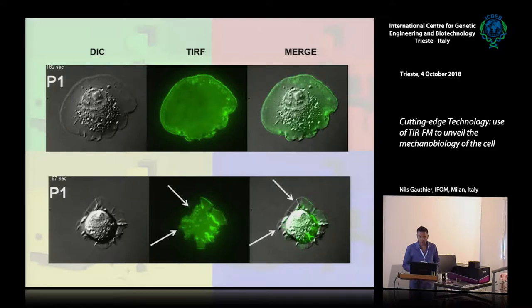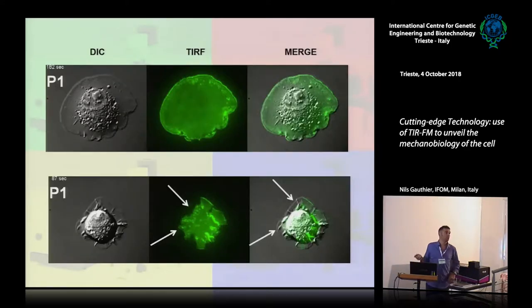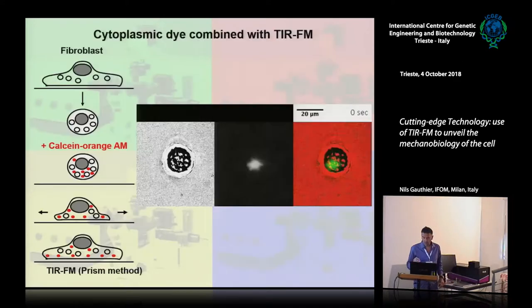Then you can start to have more precise and more important messages. This is done with the through-the-lens system, high resolution, but single cell mostly. This is another example that I picked, and this is a paper that very well used a cytosolic dye here. Somehow it's a default staining. The goal is to have a high contrast to noise ratio, and we use the prism microscope here.